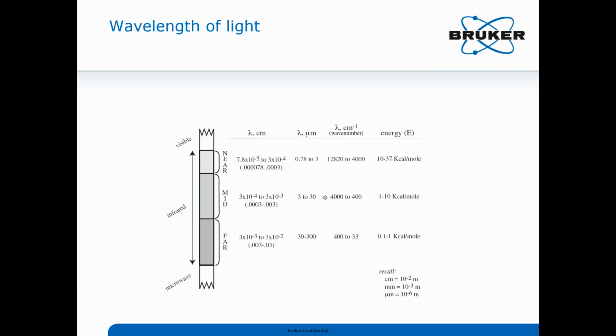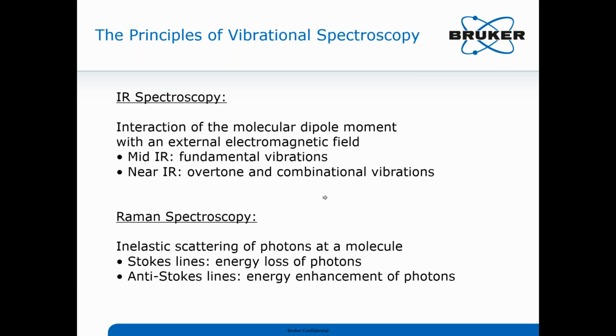So just prior to this webinar, I have a guest visiting with me today, and she has a really wonderful painting, and we're looking at the media, what is the paint made out of, and we've found so far that we have an alkyd enamel that we use the infrared to do the analysis for, and then what are the pigments? We actually use the Raman for that because most of these pigments have metals in them as the center to the key molecules, and those are more evident in that far infrared region that is accessed by Raman best of all.